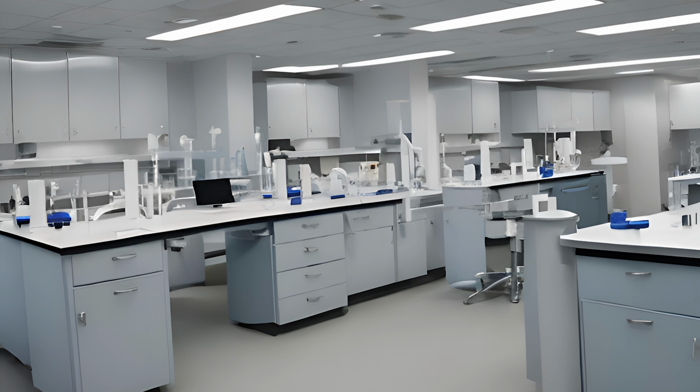They go from 0 all the way up to 4. A material that's rated at 0 for a blue health hazard is something that on exposure under fire conditions would offer no hazard beyond that of ordinary combustible materials. A health hazard of 4 is something that on very short exposure could cause death or major residual injury, even though prompt medical treatment is given.